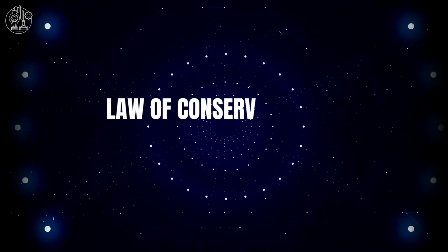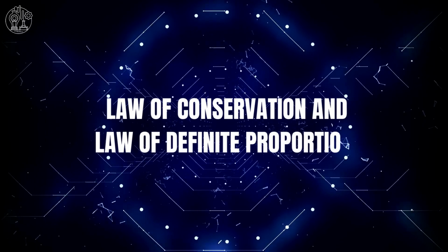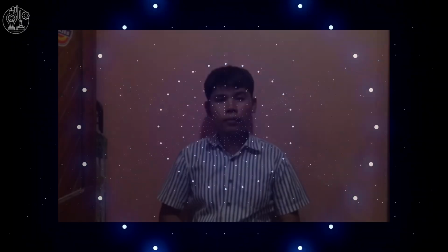The objectives of this experiment are to demonstrate the law of conservation of mass and the law of definite proportions, and to understand the meaning of limiting reagents. The oral report focuses on two essential scientific principles, the law of conservation and the law of definite proportions. These principles have revolutionized our understanding of the physical world and are the foundation of chemistry.